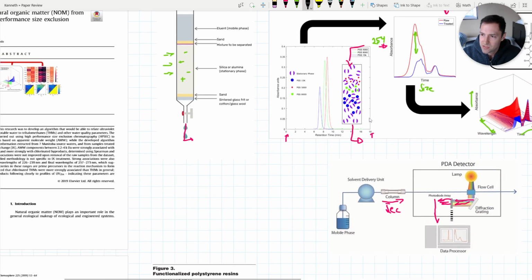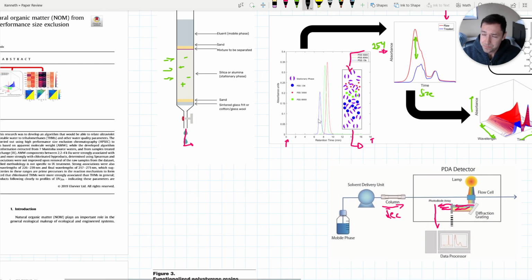That's very important because even the standards themselves have this distribution with tails. These tails are there because there are compounds within the standard that appear slightly bigger and slightly smaller. It's also because when a sample is injected in the chromatography column, there's a slow separation over time, and these develop tails.